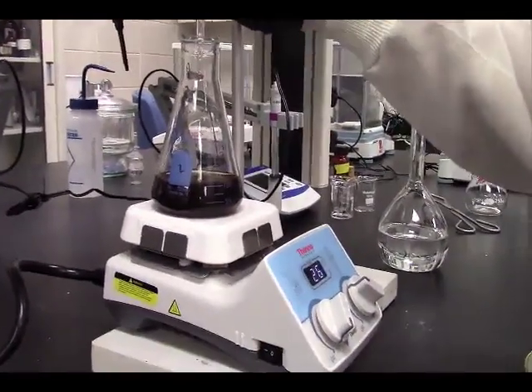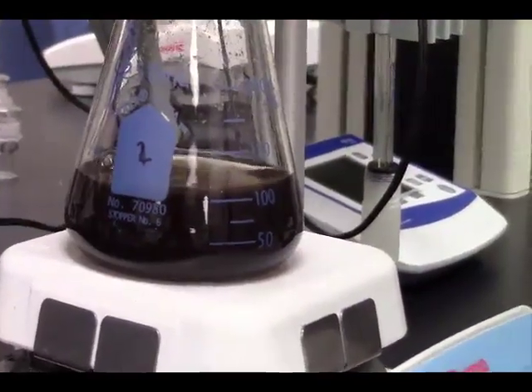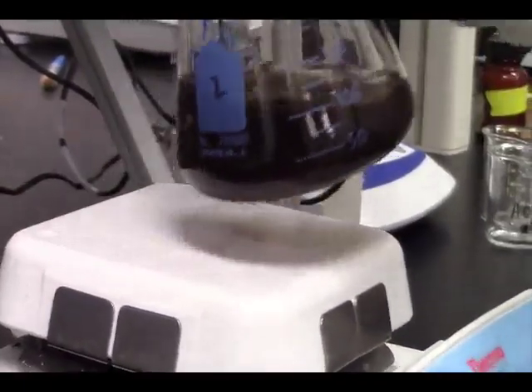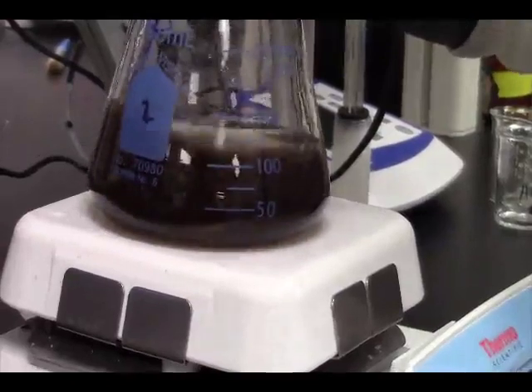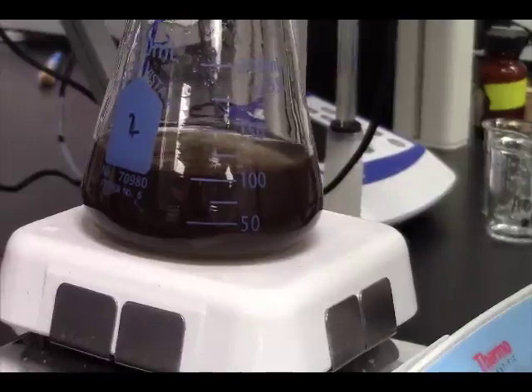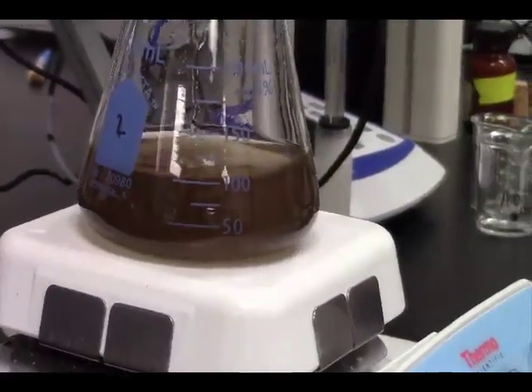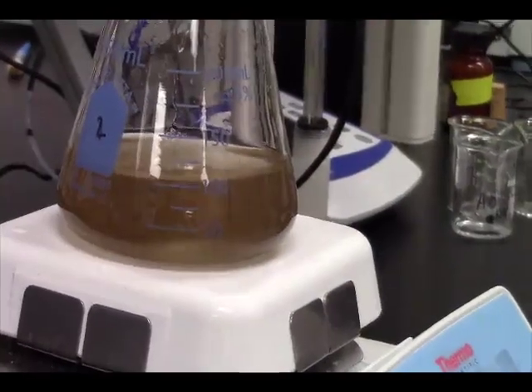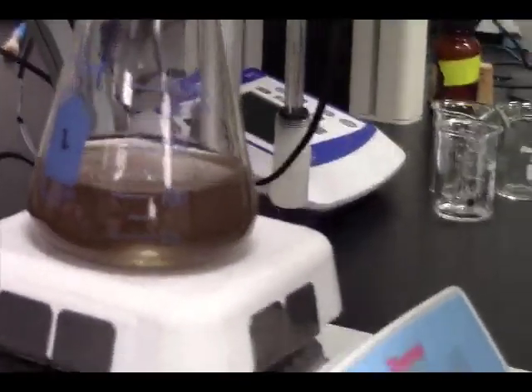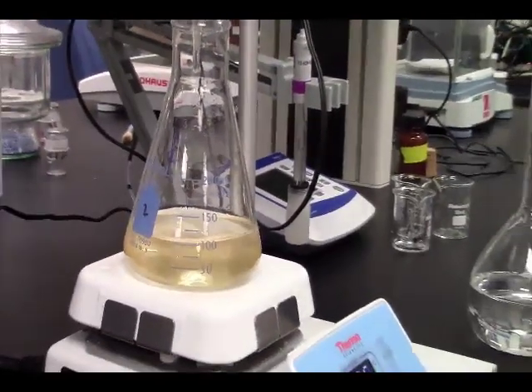And with this one, you need to go dropwise, because for some reason it turns really quickly once you add the indicator. Oh, so close. Full drop instead of a half.